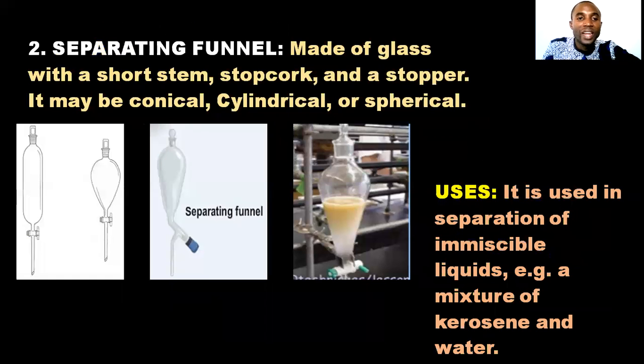The next one we need to understand is the separating funnel. A separating funnel is not just a normal funnel.